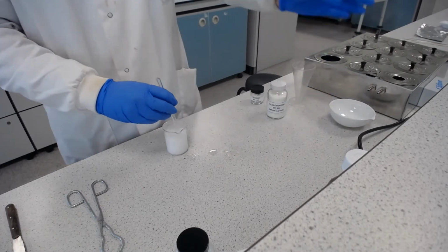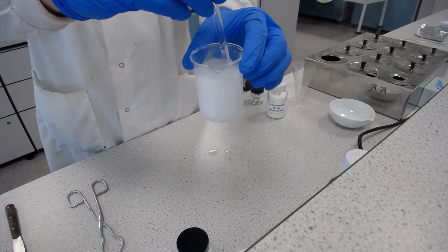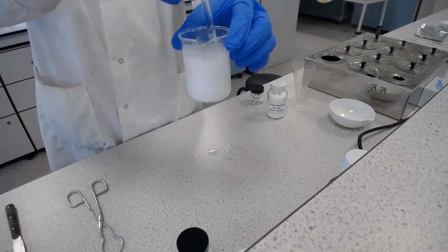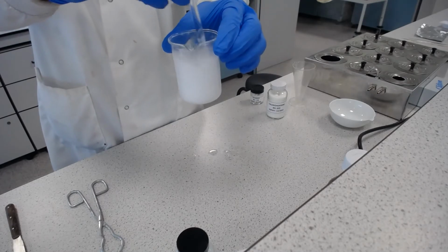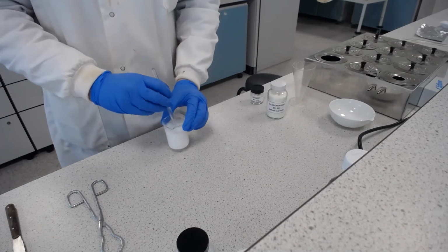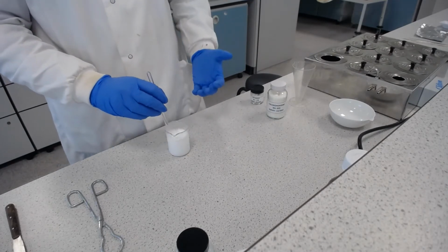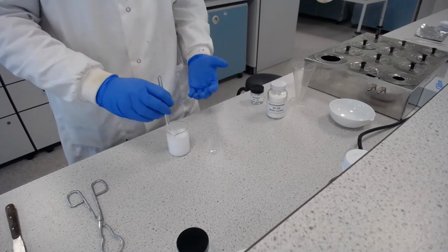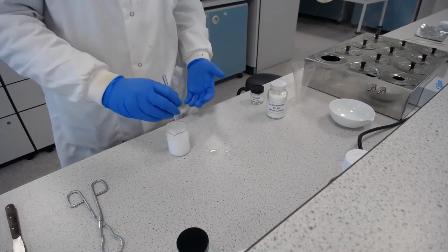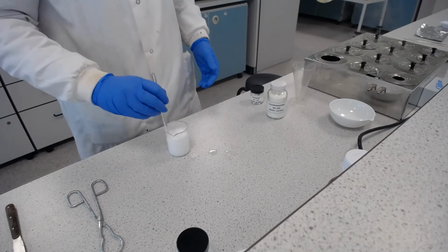So now we've got all of those mixed together and we've got a nice homogeneous liquid, however you like to think. That is still quite warm, which is why it's still as liquid as it is. That's going to get cooler and cooler, and as it cools down, those more solid waxes that we had at the beginning and those more liquid waxes that we had at the beginning are going to come to some sort of equilibrium, and we're going to get left with a semi-solid cream-like formulation.